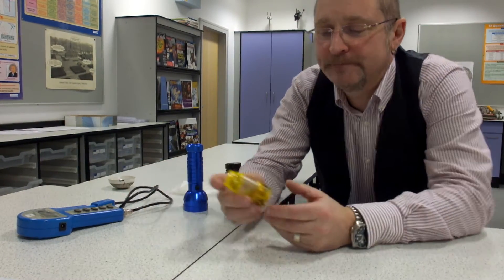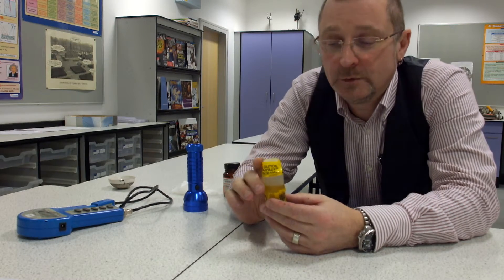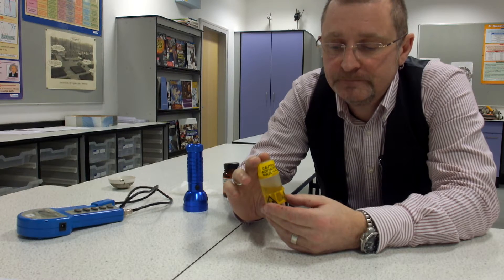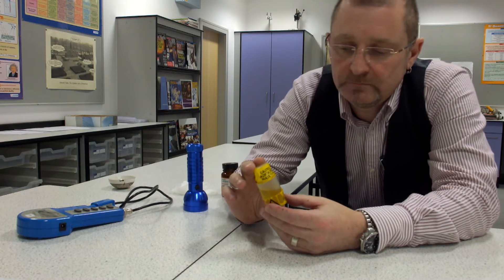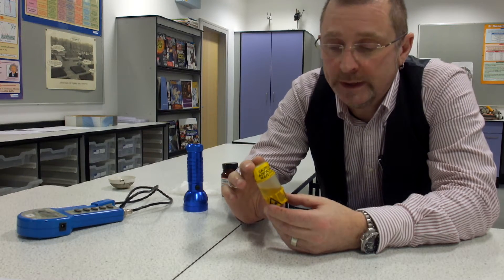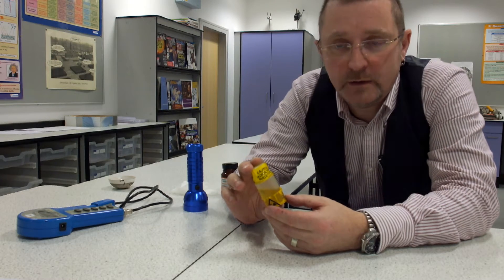I thought I'd like to show you these. This is a homemade, college-made protactinium generator. They cost a few hundred pounds each to buy normally, but we made these for less than five pounds all in, so we have a class set of them, which we use for half-life experiments.